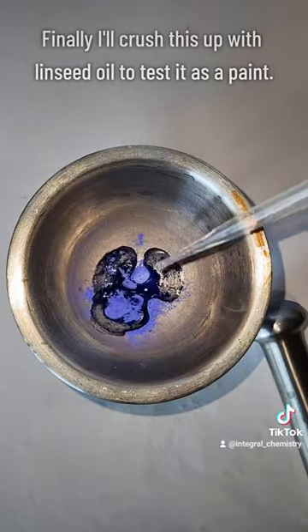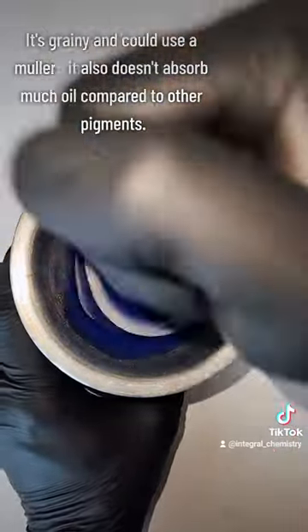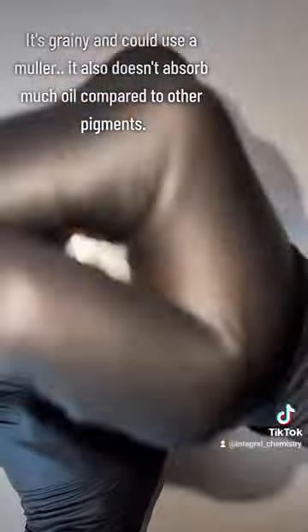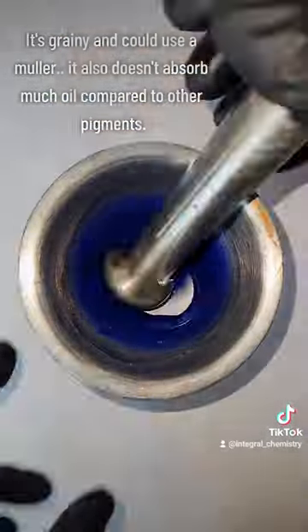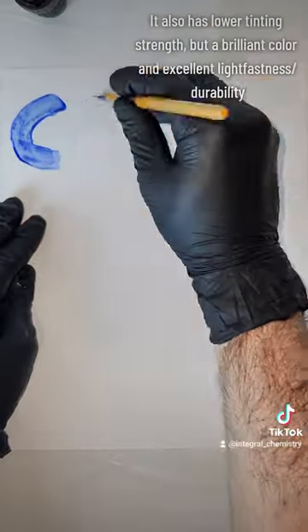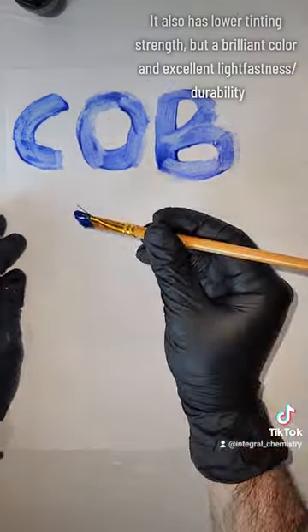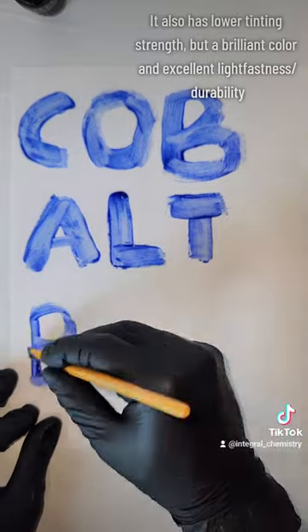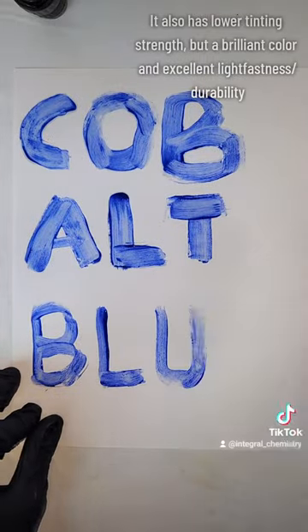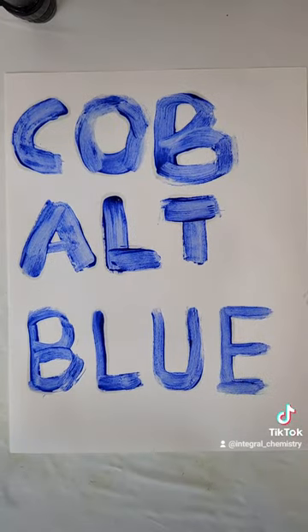As a final little test, I'm going to do what I usually do and crush it up in my mortar and pestle with some linseed oil to try to see how it works as a paint. I note that it's kind of grainy and could definitely use a muller — I'll get one someday. It also doesn't really absorb nearly as much oil as a lot of the other pigments I've synthesized. Despite this and its somewhat low tinting strength, it has a brilliant color that I like more than any of the blue pigments I've synthesized so far on this channel.